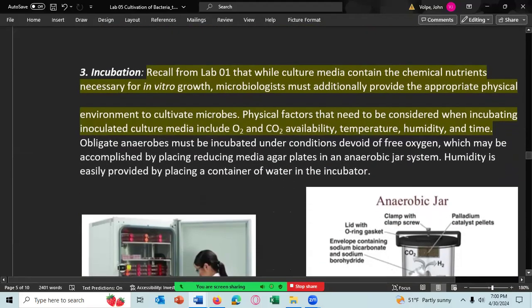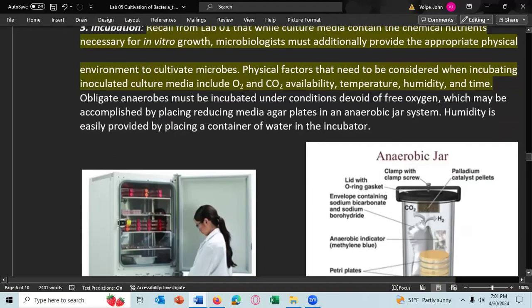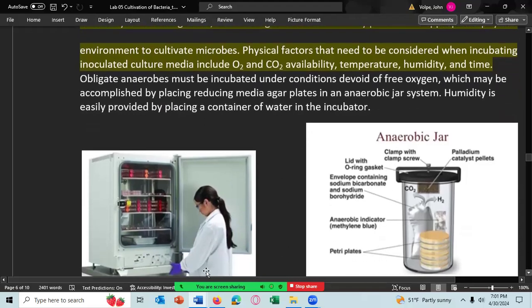All right, then you do incubation, grow the culture under conditions to grow the bacteria. We have incubators, which can be fancy and control, obviously, the time, the temperature, the humidity, and some that are really fancy, like this one here, can control the amount of oxygen as well as the CO2. In our lab, we only have simple incubators, which obviously you can control the time. You put the culture in to grow and then you take it out when it's time.